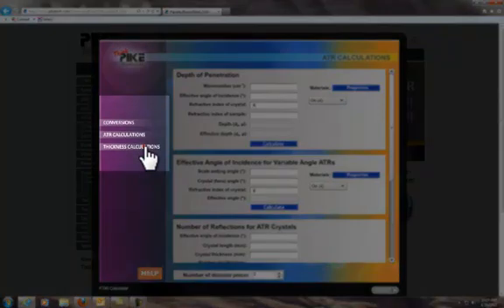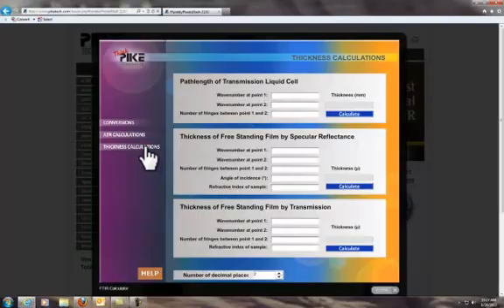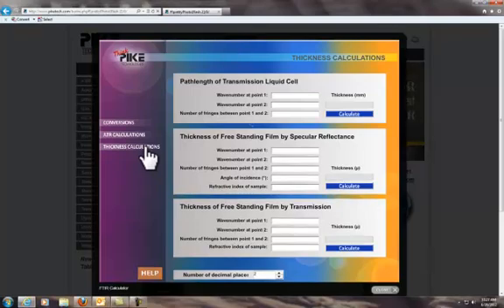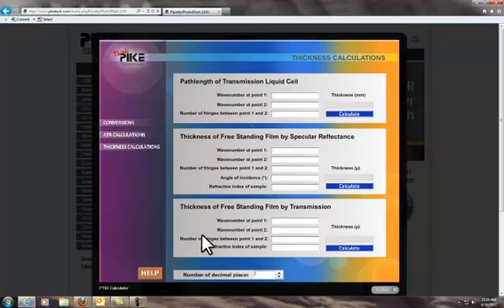The thickness calculation page is where you can easily calculate the path length of a liquid transmission cell or film thickness. Let me demonstrate how to find our contest question solution.